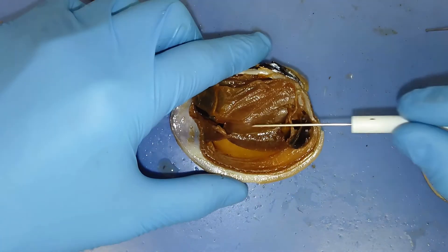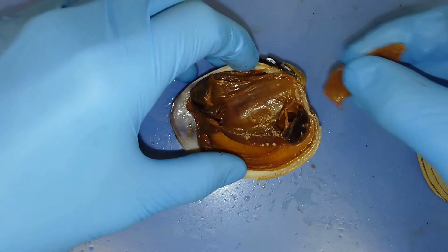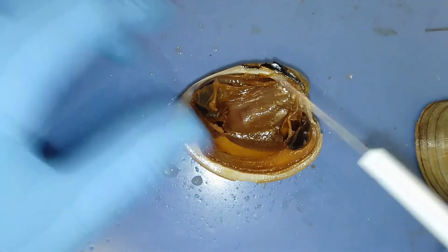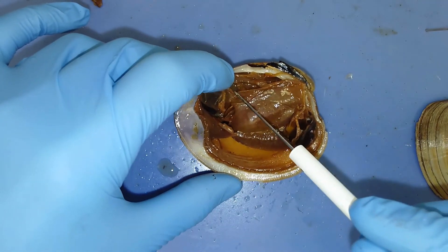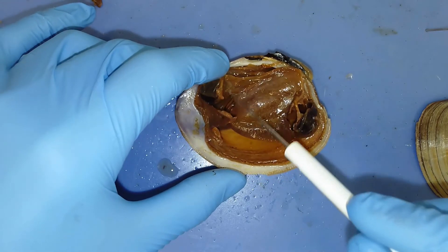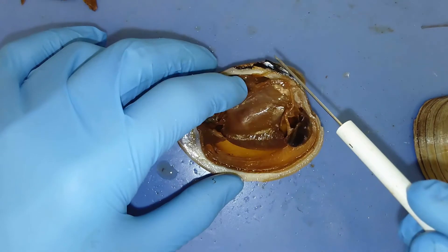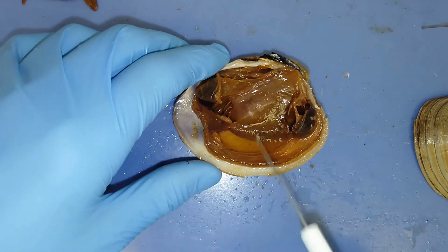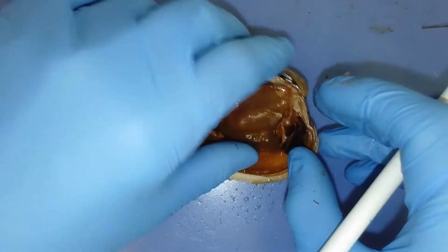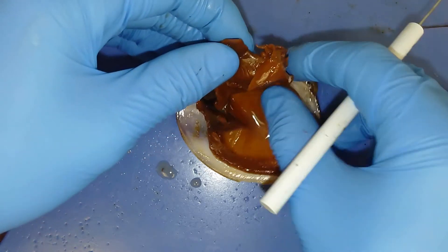If we move these gills out of the way, we'll be able to see this really membranous structure. Here we have the pericardial cavity, and this membranous structure here is what we consider the heart — it's actually going to be pumping that body fluid throughout the body. I'm going to tear out this muscle and we'll look at some more of the internal features.